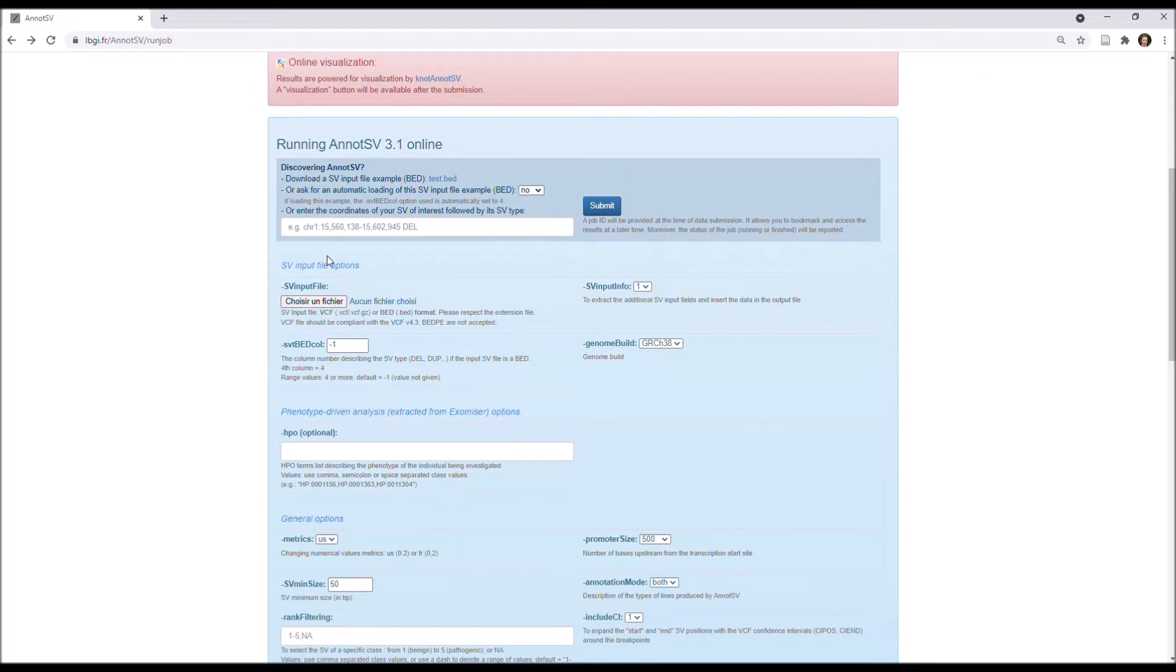So if you want to use this example, you need to set this option to Yes.